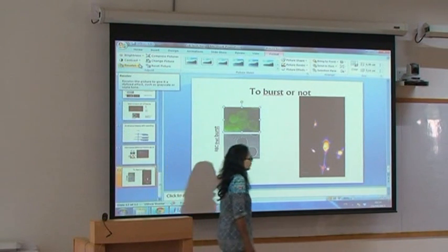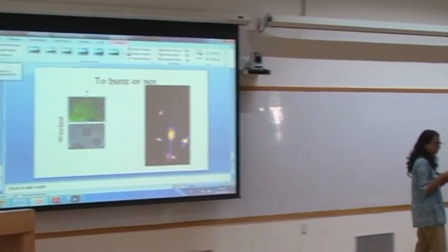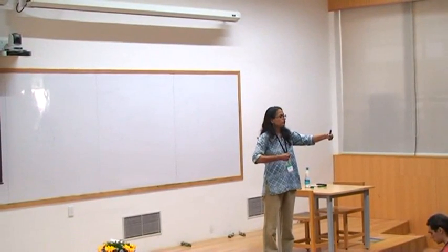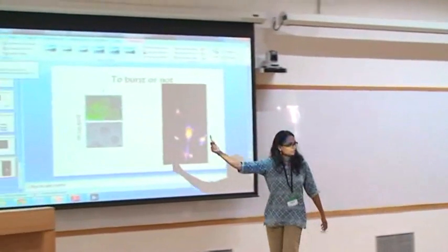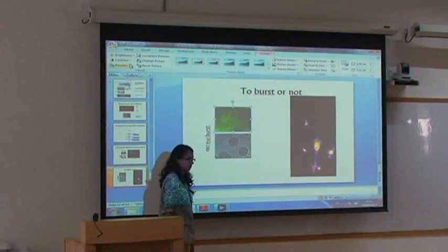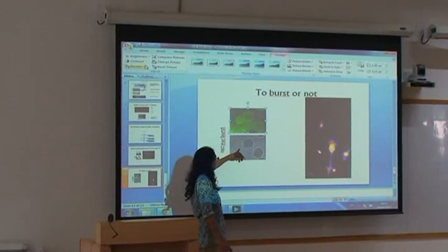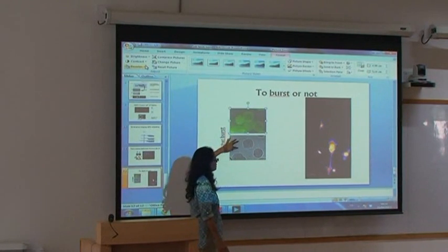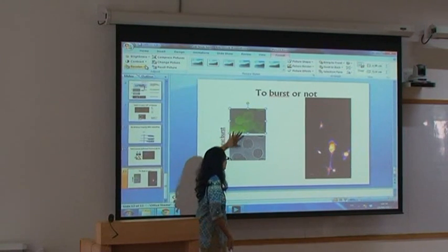These were red blood cells that we put on a polylysine kind of coating so that they stick to the surface, and we stressed them, and we could see multiple cases of rupture. It's hard to make out rupture, but this is a different way in red blood cells. This is a fluorescent lipid on the red blood cell. Even on a ruptured one, you see that. But what you lose is the bright field image. This is a cell which is ruptured. It cannot be seen in bright field because there is no change in refractive index between outside and inside, so you can't just see it.